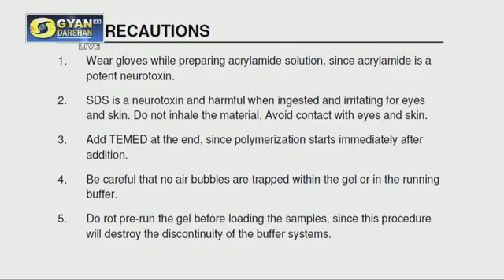Finally, before I conclude, again the precautions. So you should handle acrylamide, bisacrylamide with care, because these are neurotoxins. So you should always wear gloves. SDS, it is also hazardous. So avoid ingesting, and it might cause irritation for eyes and skin. Do not inhale the material.